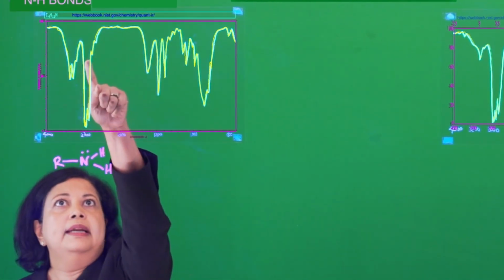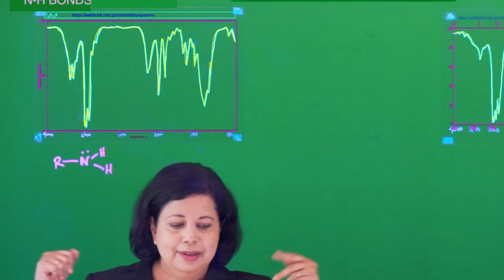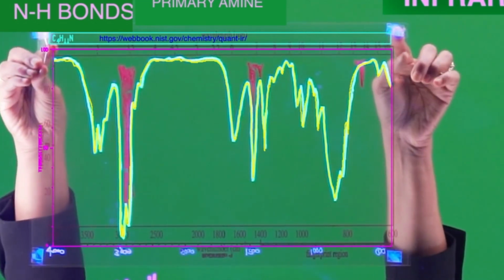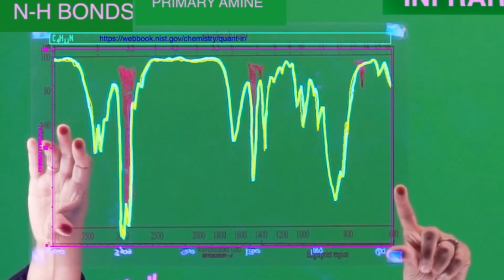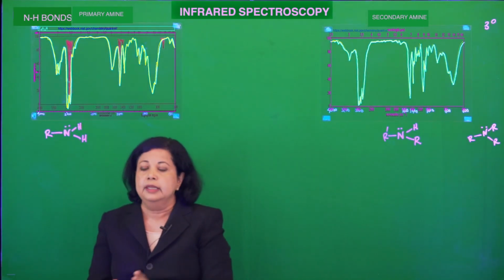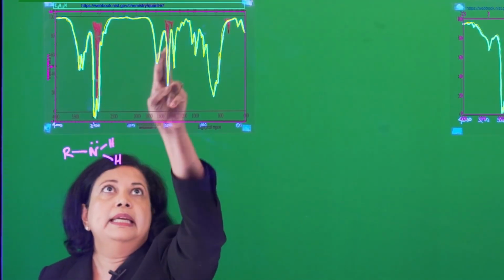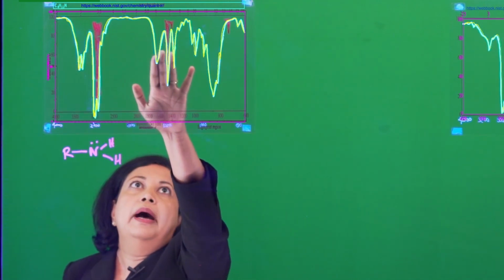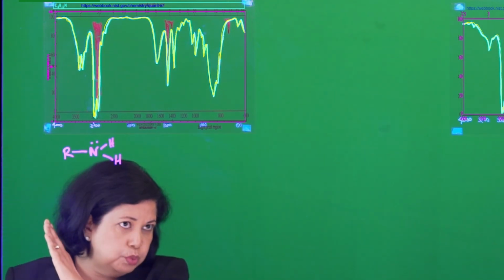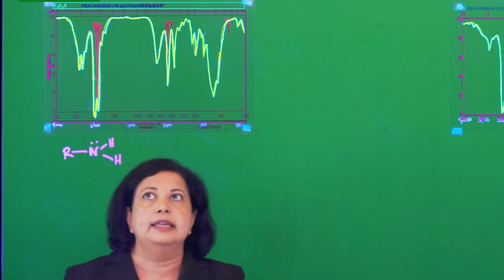Well, you immediately recognize the CH peaks and the CH bends, right? That means it's an alkylamine. You don't see anything really in the sp2-CH region, so it's probably an aliphatic amine. That means there's no double bonds and stuff. So we can kind of account for these peaks and these. But what about these? What do they mean? Let's look at one of these. Let's sweep, just like the infrared machine, from left to right and see what all these things are.